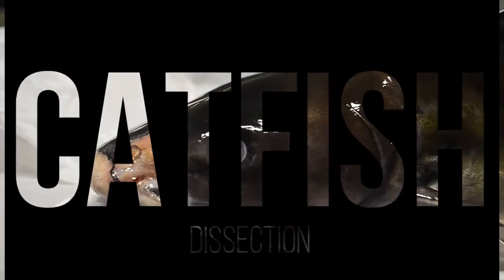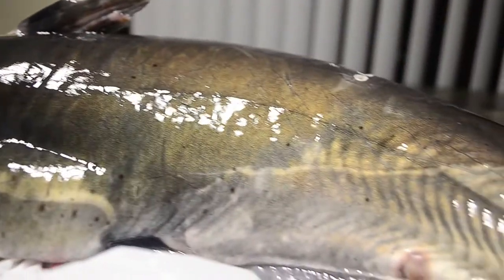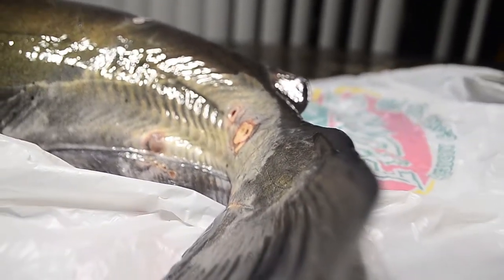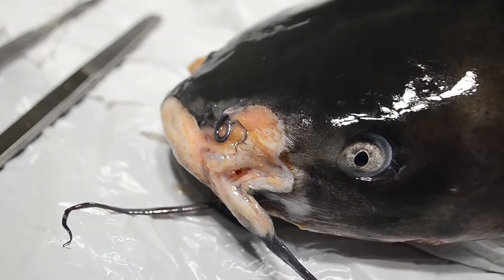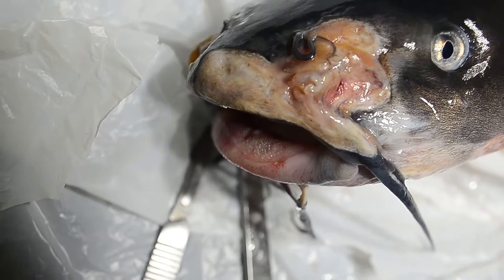Hello, welcome back. Today we're dissecting a farm-raised catfish. This one is actually a hybrid between the channel and blue catfish, and they cross them for a number of benefits such as high fertility, resistance to disease, and faster growth. Unfortunately, as you can see, this one was sick from something. In a farm-raised setting, disease can spread quickly and outbreaks are often — that's why there's a race to breed the most resistant fish.